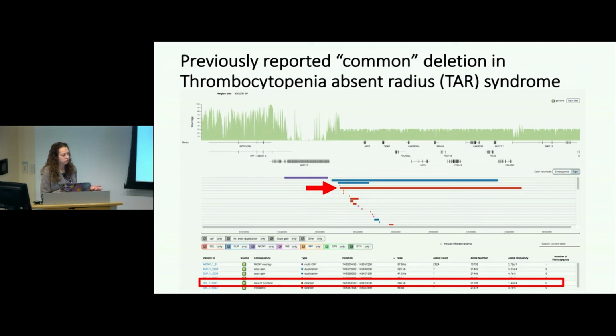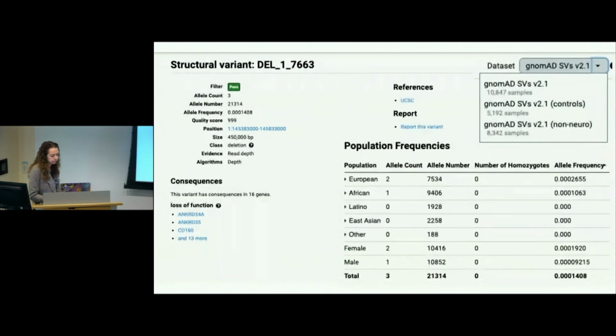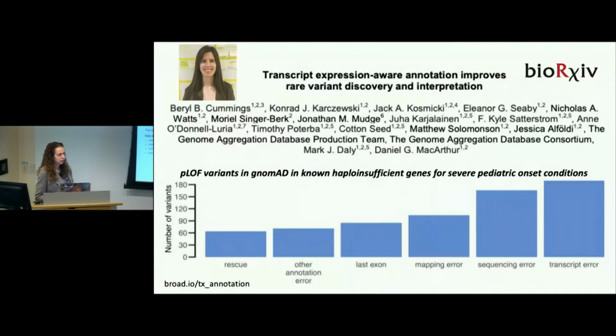But now when I have a copy number variant from an array or something else, I'll often come to see if we see it in the general population. And this is another data set that over time will be growing to be eventually on gnomAD v3 and have a lot more genomes. Any questions on that before I move on to the next?